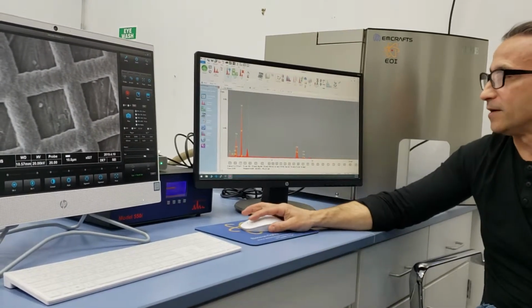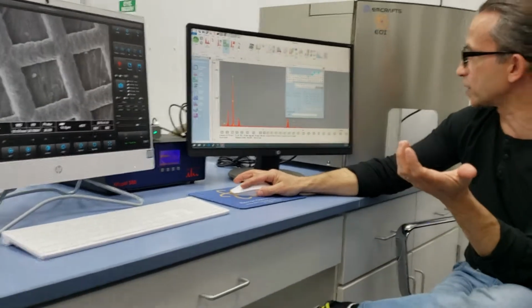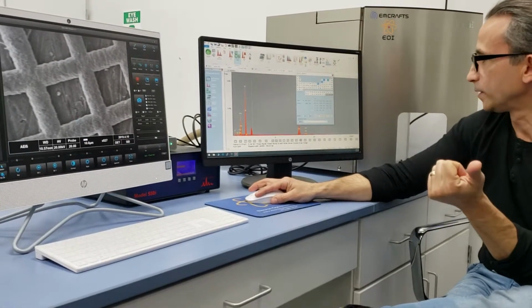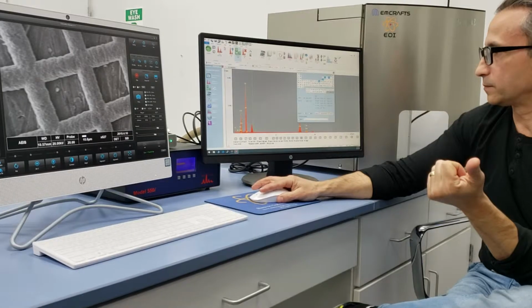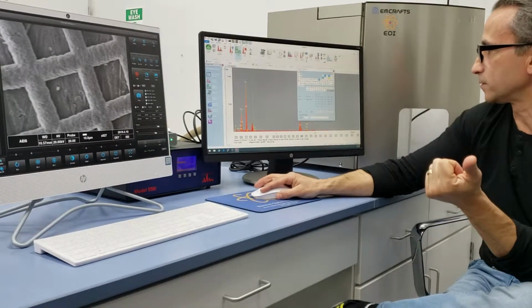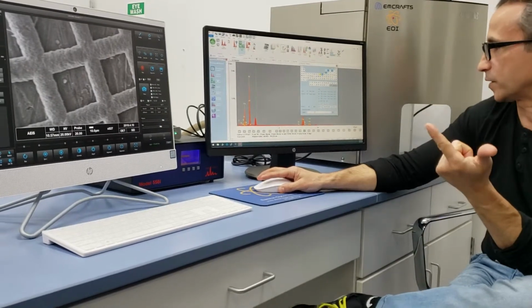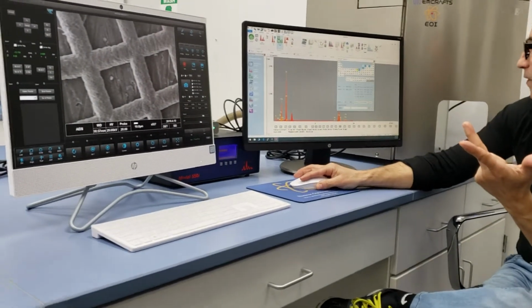All right, so again, ways of labeling. First way is you label yourself manually, right? You're checking the boxes off manually, right? Second way is, again, if you're on a chart, scroll peak identifier, you label it, right? You scroll through and then you hit add, right? That's the second way. Third way is K alpha buttons, right? K alpha button. That's the third way, right?